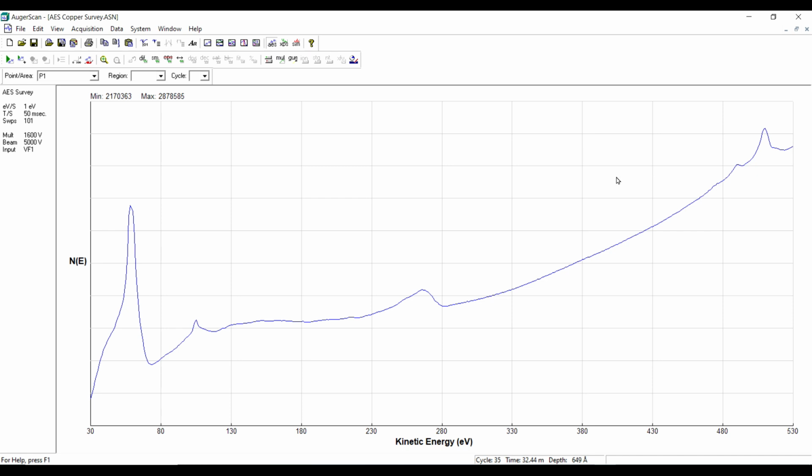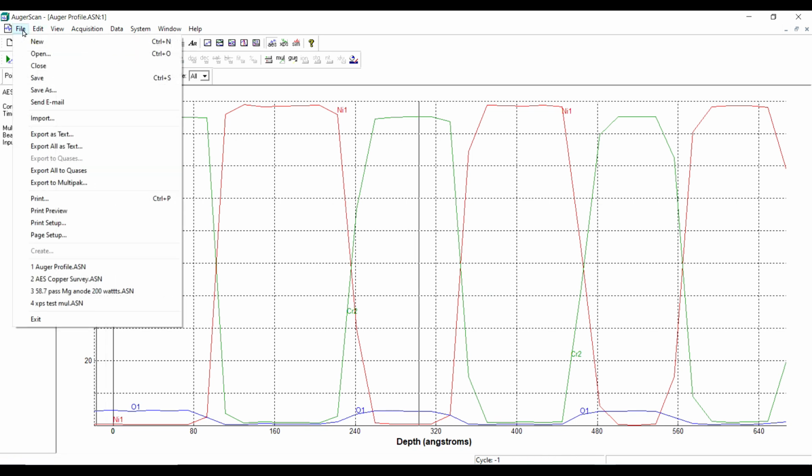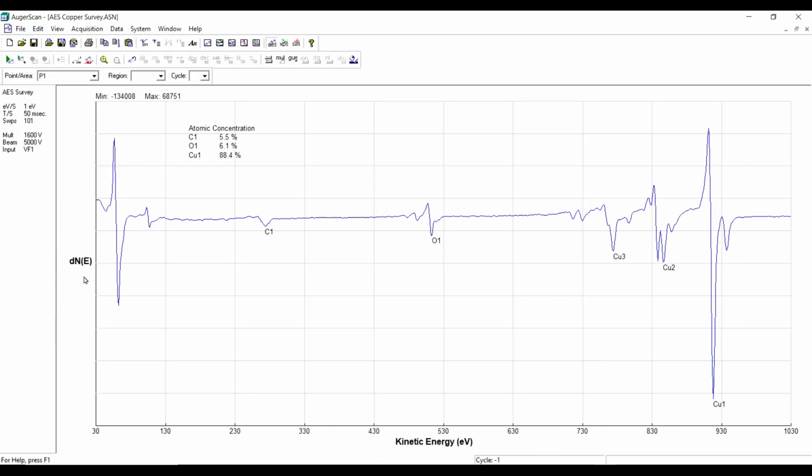However, think of this like a Word document. Maybe I did this deliberately, in which case now I want to save this new data set, say save as a new file name, of course. Or I can just simply say file, close, and say save changes, no. Now if I go back here, open it up again, it's right where it left off. Okay.